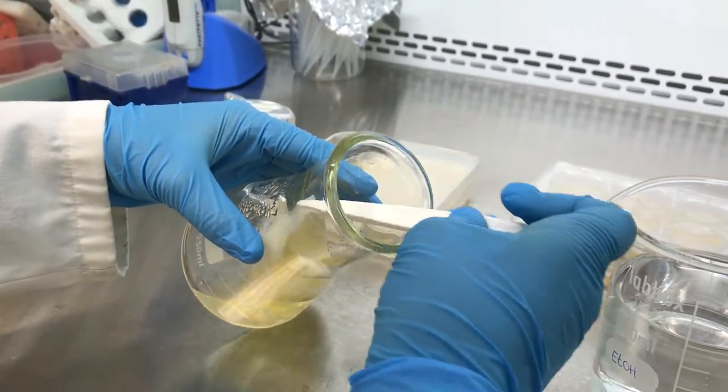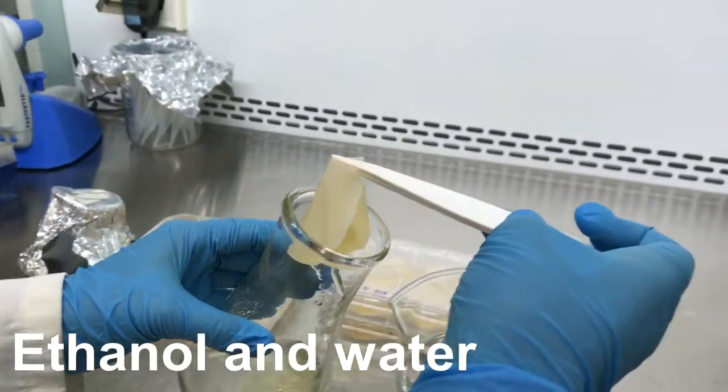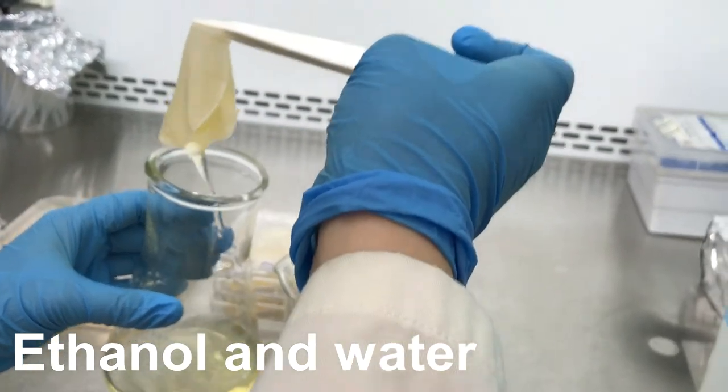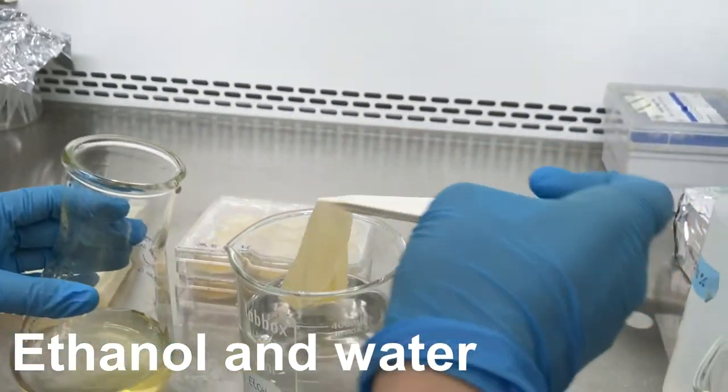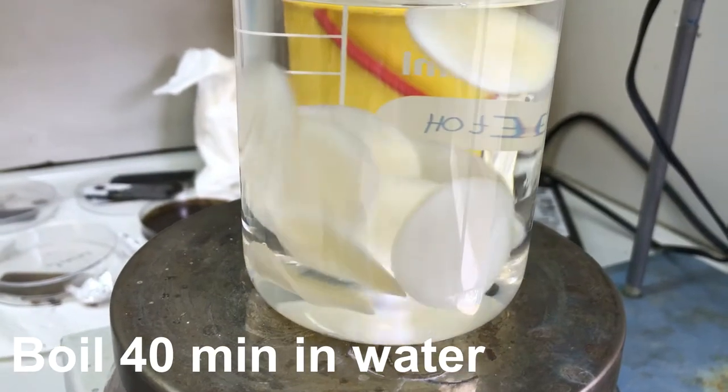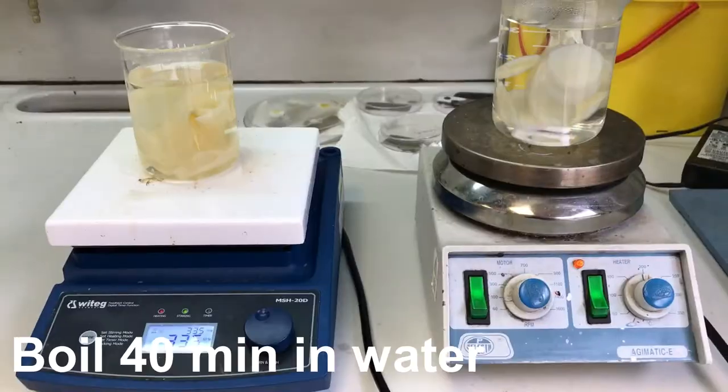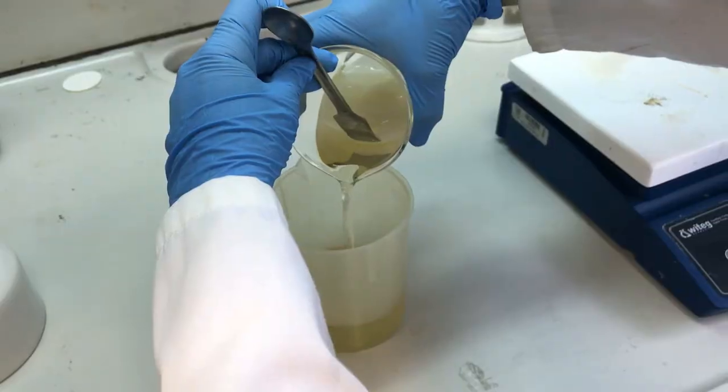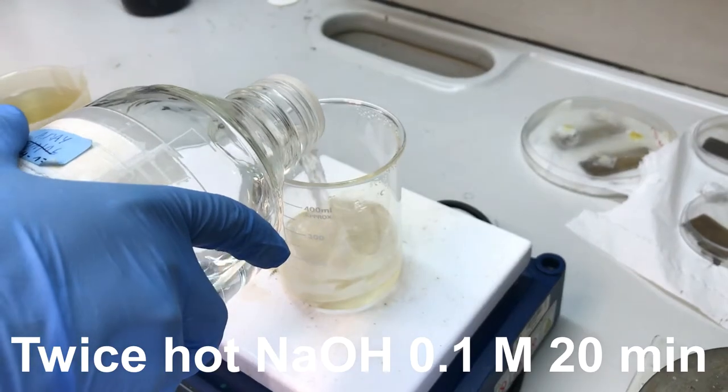And before using it, we need to clean the cellulose from the bacteria that remains on the film. To this end, we first place the cellulose in ethanol, and then we wash it with boiling water first, and then with hot sodium hydroxide, a strong base.